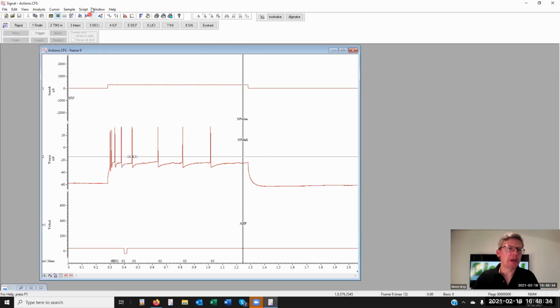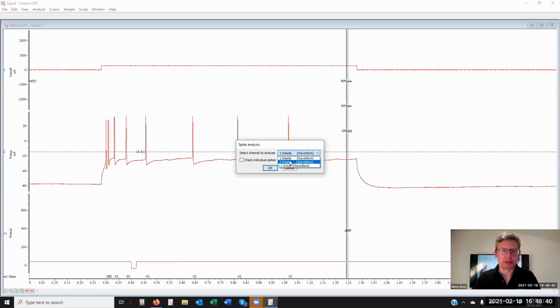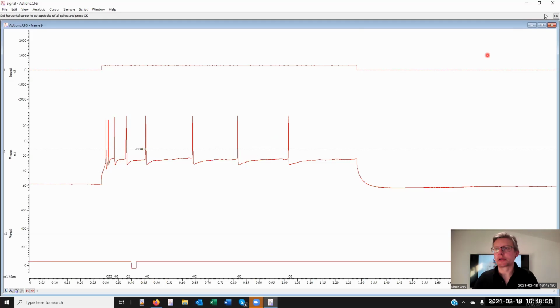Okay, so we've got actions: script, run script, interest spike analysis. So we're looking at channel 2, check individual spikes. Okay, so here we're asking where would we threshold for the spikes. We say okay.